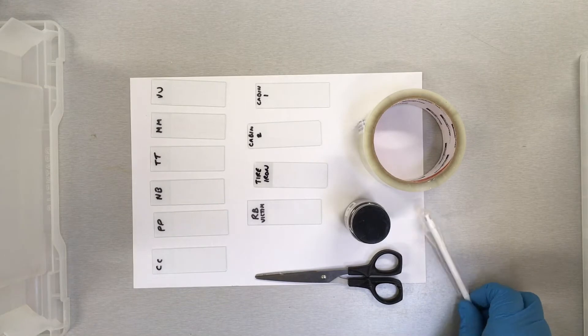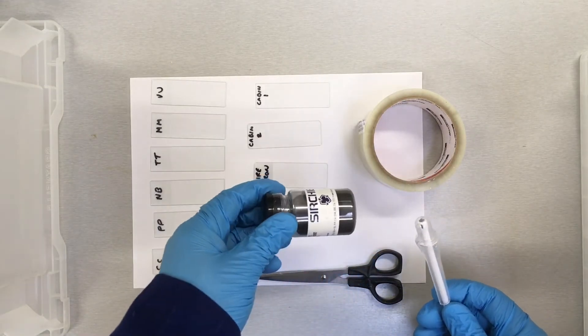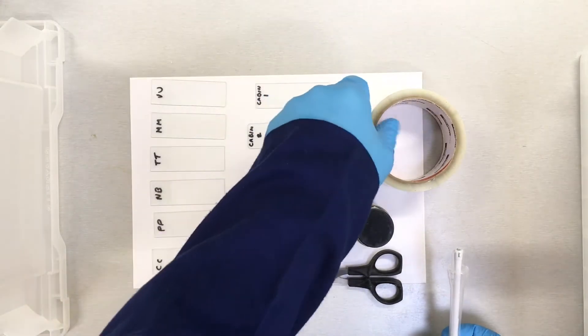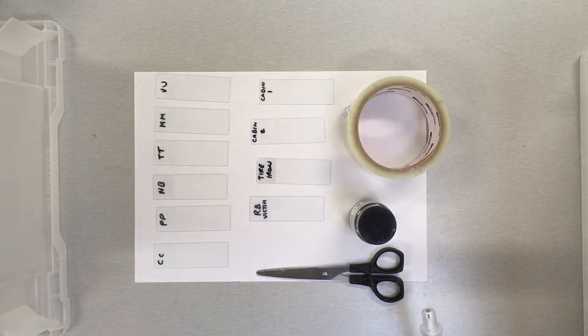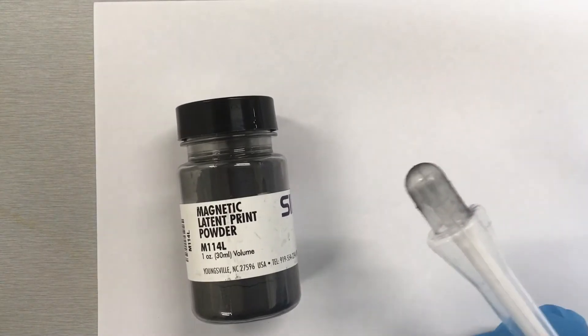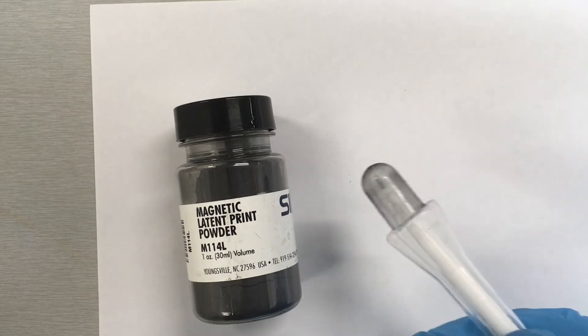What we'll be doing is using this little applicator that is a magnet and we're using magnetic powder to swab each of the slides to extract a print. Here we have a magnetic latent print powder and a little magnetic applicator. We've actually got a magnet inside that plastic little tube.